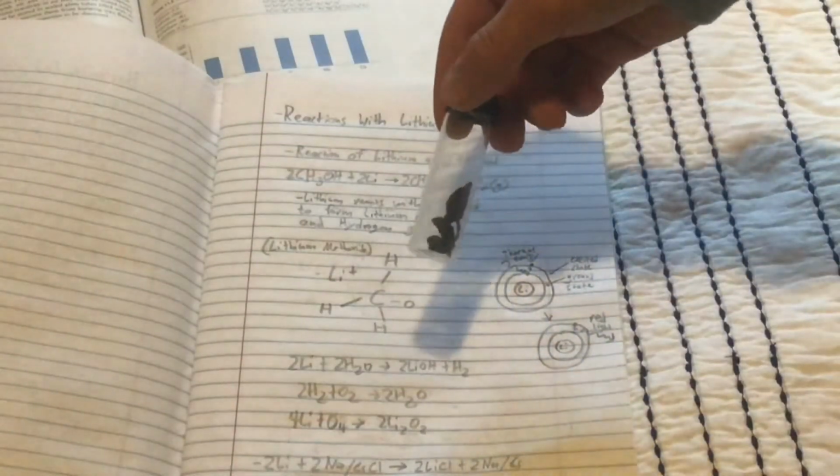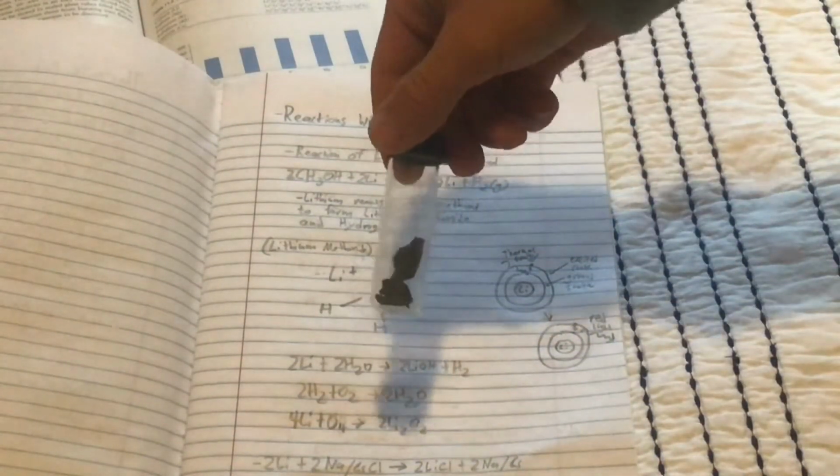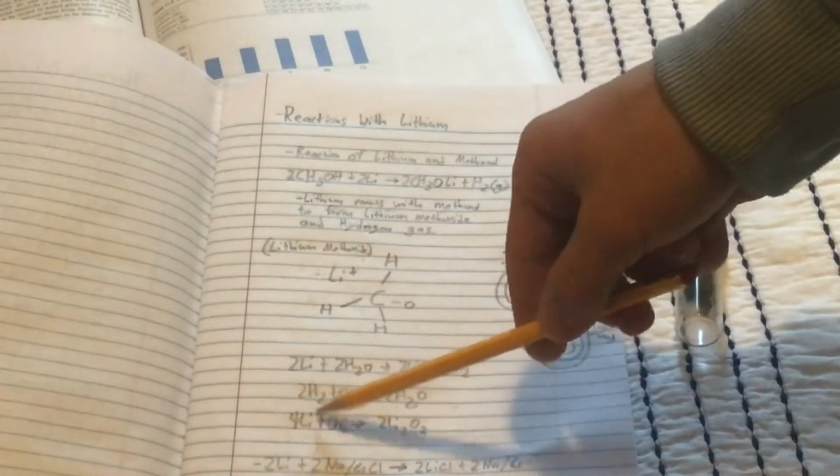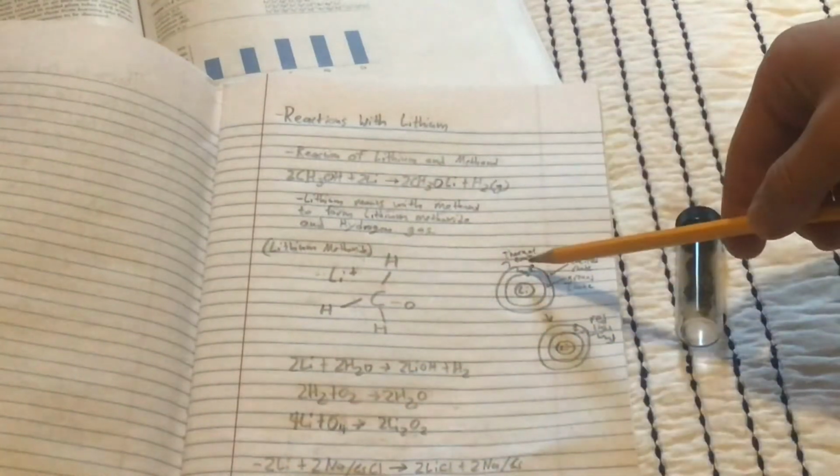Speaking of burning stuff, we still haven't tried burning the actual lithium itself. Now, when lithium burns, it bonds with oxygen to form lithium oxide, and of course a lot of that lithium in this reaction gets excited to release red photons.